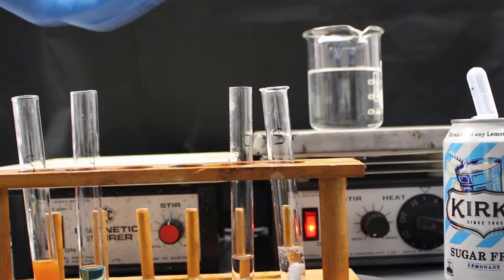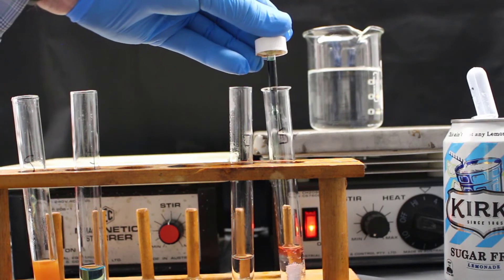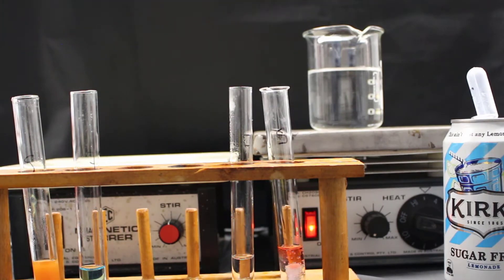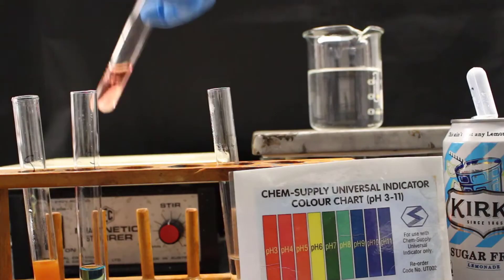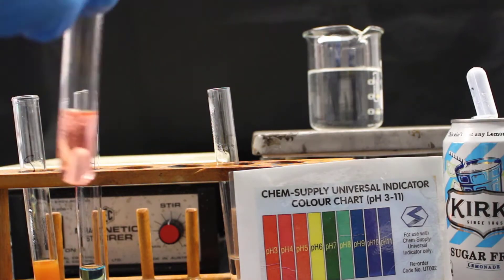After 5 minutes in the water bath, we need to neutralize the acid. So to do that, we add a few drops of universal indicator and then add a base, sodium hydroxide.